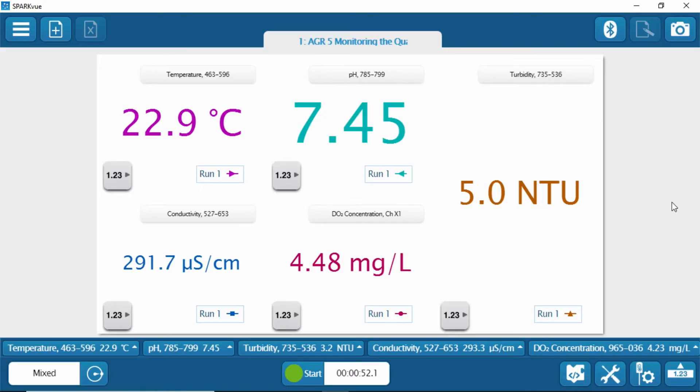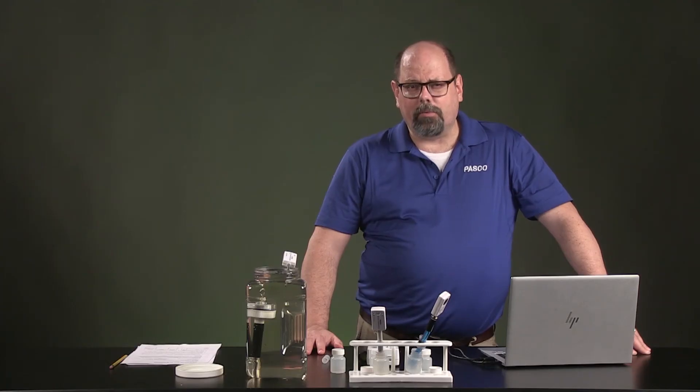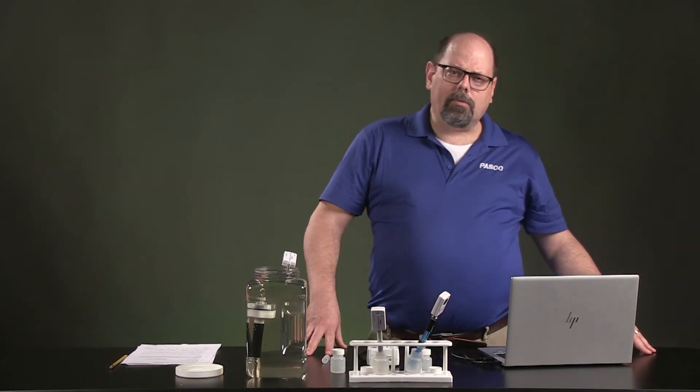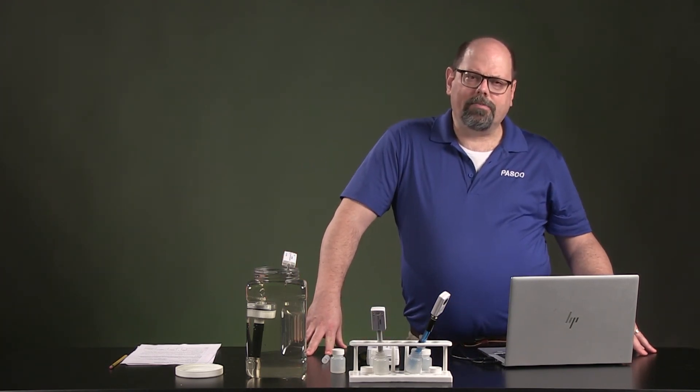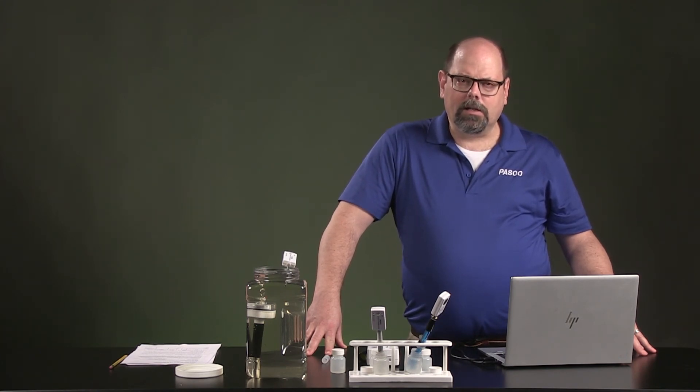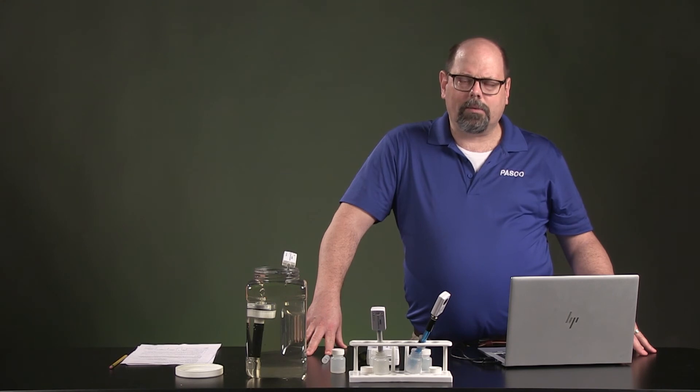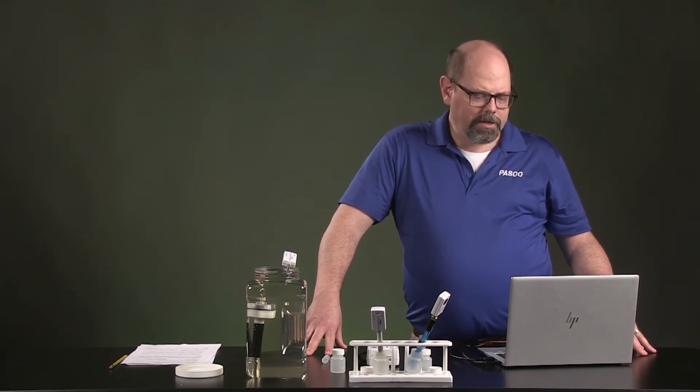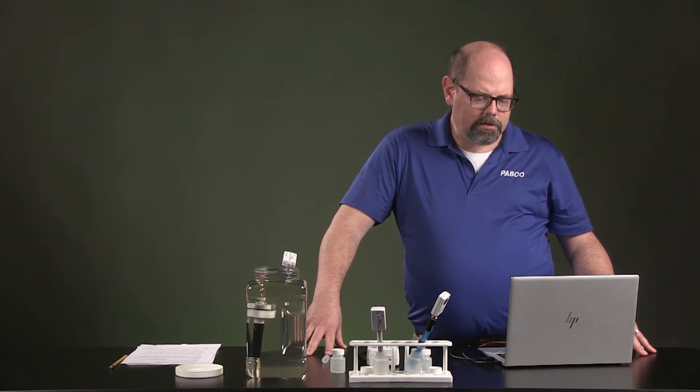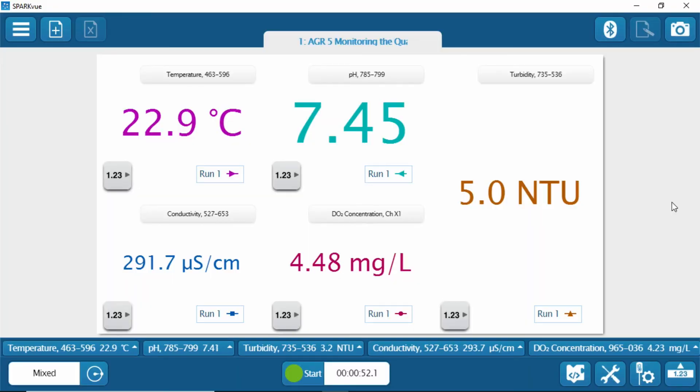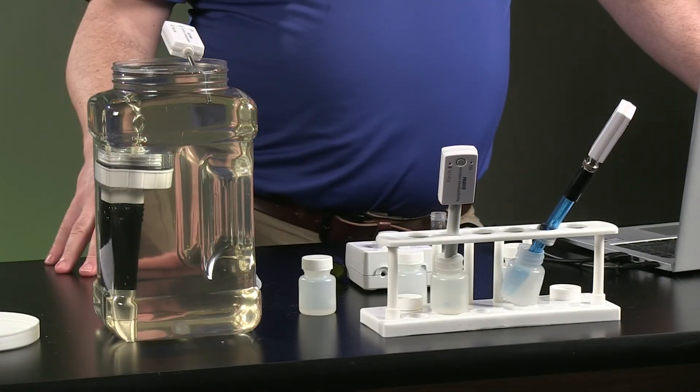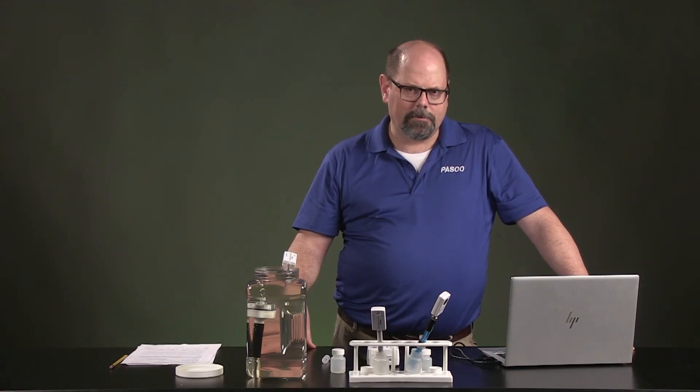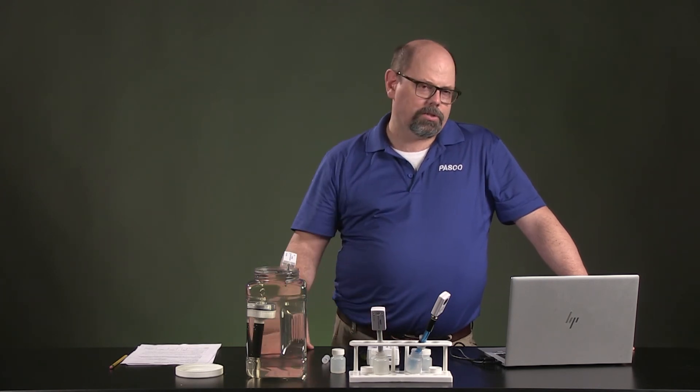In the pH, we can see we have about seven and a half. The pH scale we talked about goes from zero to 14, where the lower numbers zero, one, two, three, four are acidic, acid rain four, five. And if it's got a little bit eight or nine, that's typical for ground chemicals that it might run over like limestone. So you can take a look and see if it's in that sort of healthy range and give a description of those. Turbidity can range from zero to 100 is just slightly cloudy. You can see just even in this sample here that we're looking pretty clear and we have evidence of that as well, not just in the turbidometer, but also just looking at the sample.